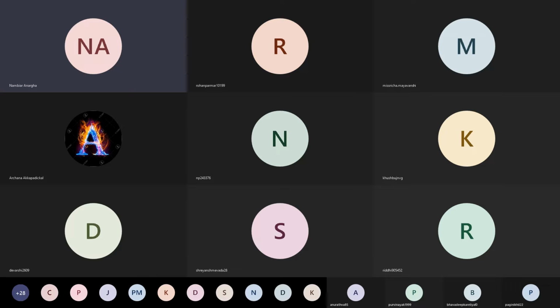अगर हम उसको प्री सैचुरेट नहीं करते हैं तो सपोज ऊपर के पोर्शन में, the upper side of our TLC plate, so if it has not been pre-saturated, तो जितना हमारा against the gravity जो सॉल्वेंट सिस्टम रन होगा उतना ही। अदरवाइज अगर प्री सैचुरेट करके we are using that TLC plate to run, in that case हर जगह से सिर्फ और सिर्फ सॉल्वेंट मॉलिक्यूल्स ही इंटरेक्ट कर रहे हैं, मेरा कहने का मतलब वो है। ठीक है, क्लियर ना अब तो?